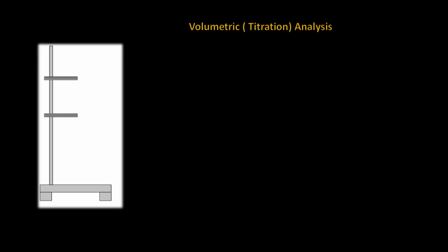Titration has been used as a traditional method for the determination of the concentration of an element. It is a traditional, long-standing method of quantitative analysis. It has long been considered a reliable method for the analysis of the concentration of an element of interest in a solution. The procedure is simple in complexity.